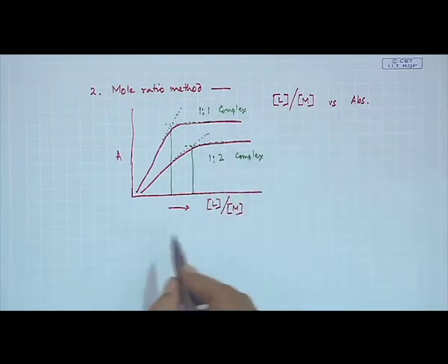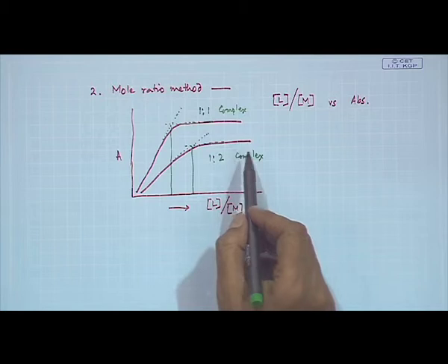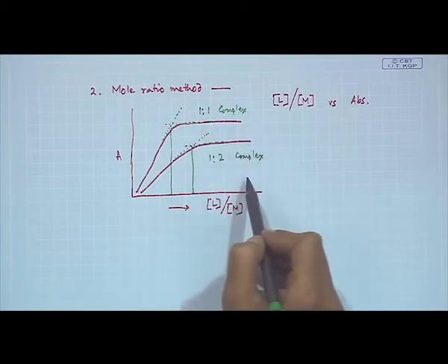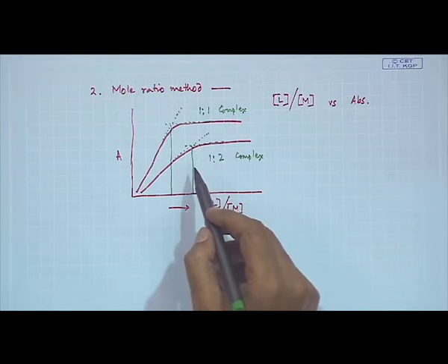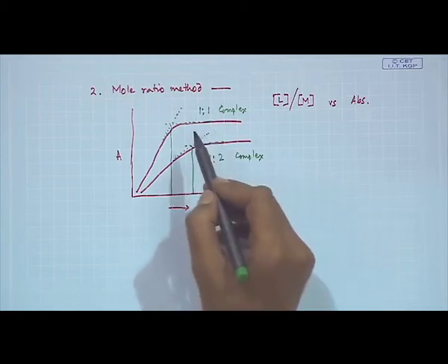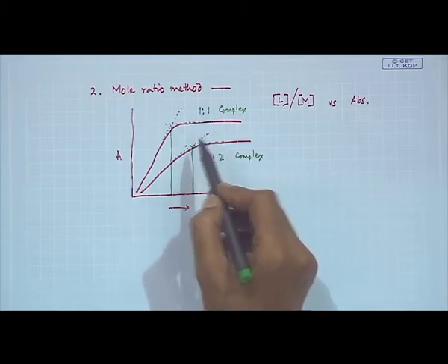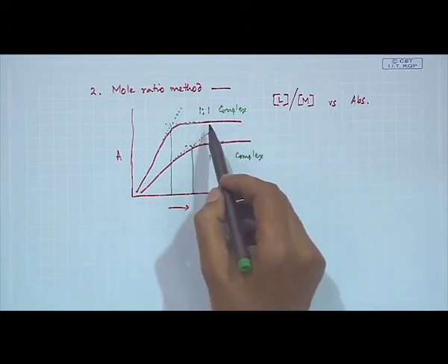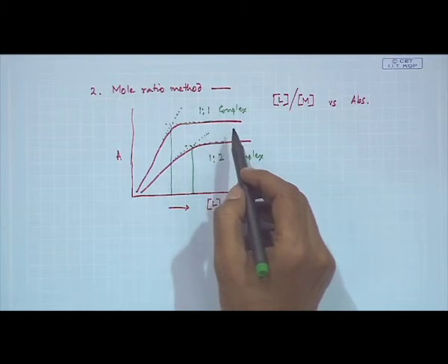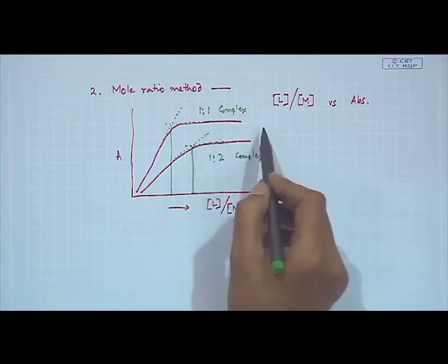So, in all these cases we see which way the complexation reaction is going. In some cases, the method of continuous variation is useful, as we have just seen, and we can determine a 1:3 type of complexation where the mole ratio is 1:3.